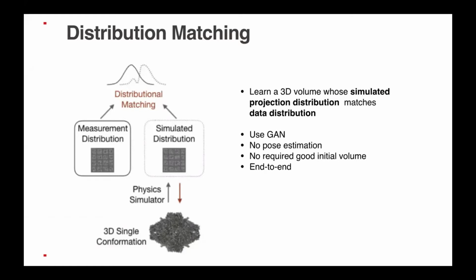So instead of thinking from the normal deep learning point of view, which is training, we can say that our method is actually optimizing. We can say that our method optimizes or reconstructs the structure, because we are not exactly training. It's just an algorithm which reconstructs the structure, just like other algorithms.